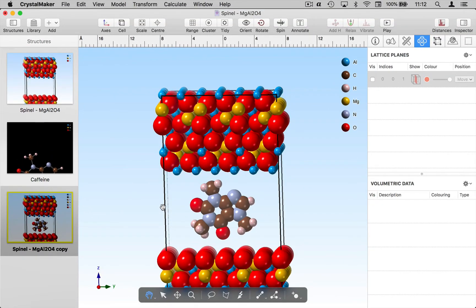So there we have it then. We have a quick tour in which we've inserted a molecule into a crystal and then merged the two together to give us a new hybrid structure.